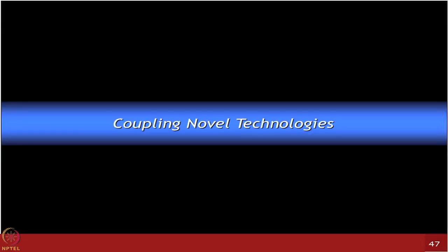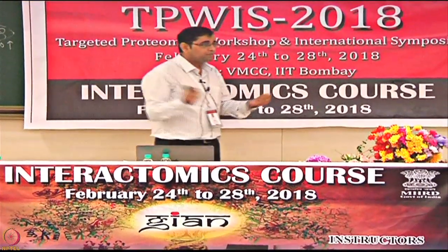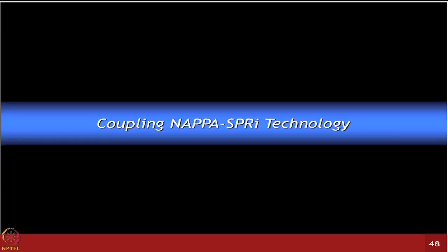All right, so over this period, what you would have realized from the various lectures given by Josh is that there is so much need for integration of new technologies and development of new technologies, and that's where coupling different existing platforms becomes very crucial. In Josh's lab, we thought a couple of years ago, and many people are still working on developing those technologies, of coupling NAPPA technology with SPR imaging based platforms.